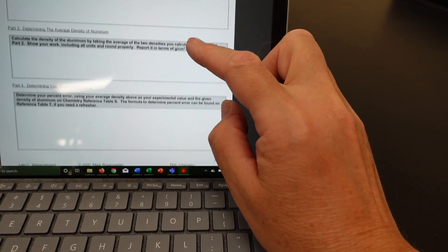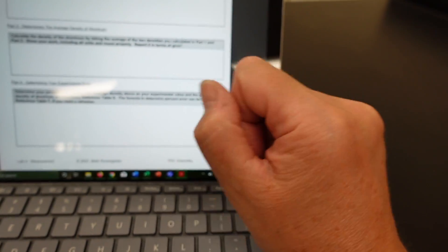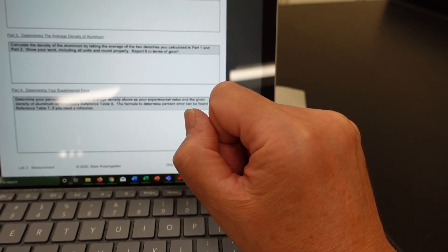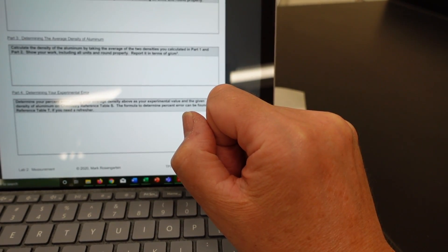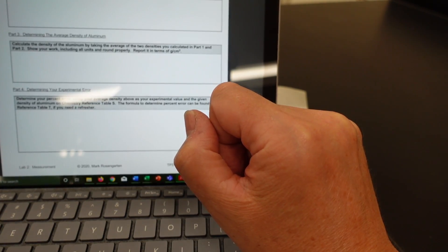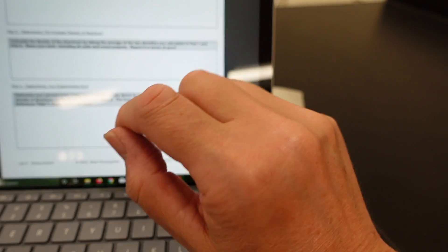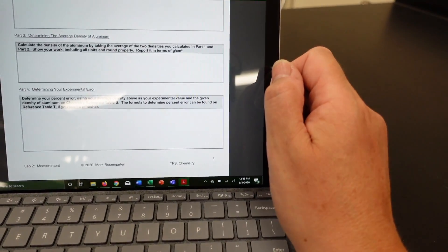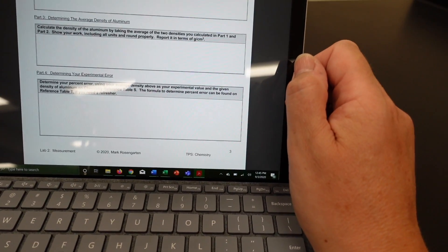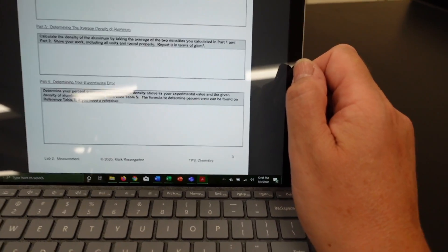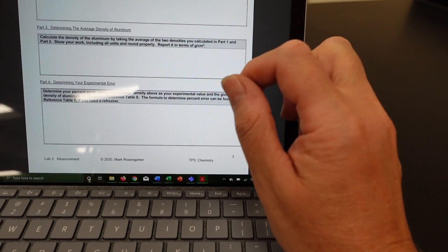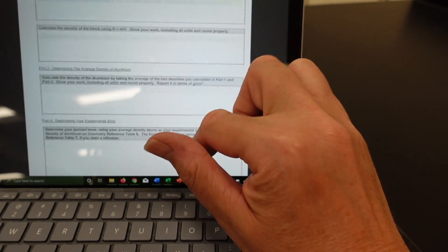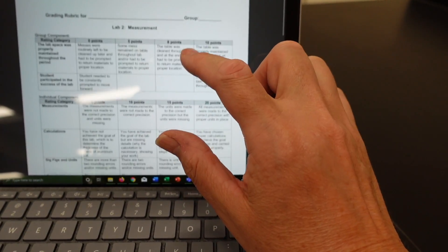Now that you're done with that, determine the average density of aluminum. Now that you're done with that, determine your experimental error. You can find the formula on reference table T of your reference tables. Once you have this entirely done, just submit it.